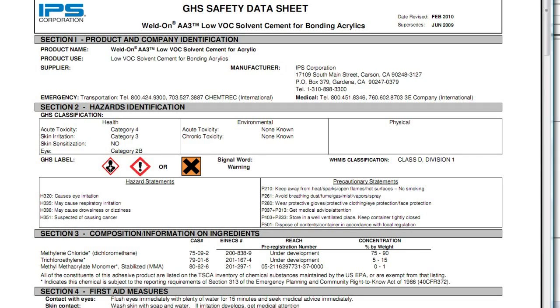I may do a future video on how to extract methylene chloride from acrylic cement. You can almost use it as is - it's almost pure methylene chloride, between 70 and 90 percent, and the remainder is trichloroethane and a methacrylate monomer. They're all volatile, so you can separate it out. I'm pretty sure methylene chloride is the lowest boiling solvent in there, so it should be fairly easy to extract.